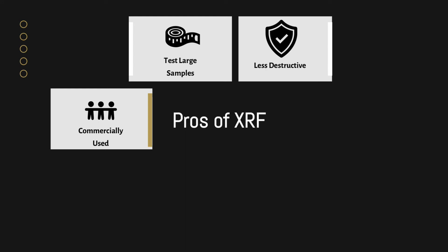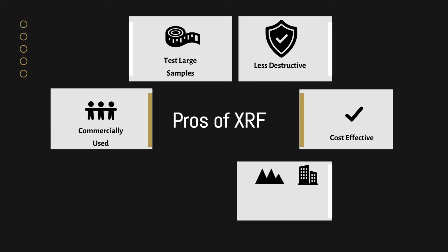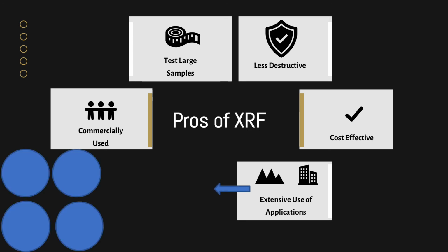XRF is a relatively non-destructive instrument compared to other technologies, which is ideal in the field of archaeology. XRF is relatively cost-effective for its extensive list of abilities, and there are portable spectrometers along with the original standard systems now available.